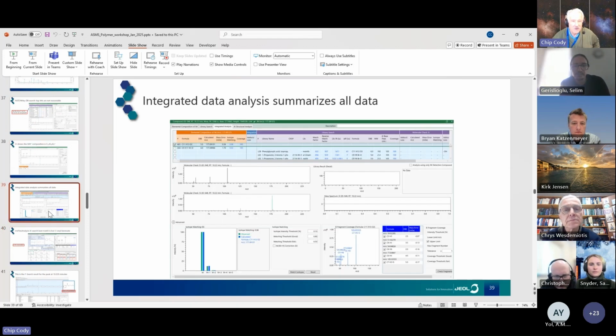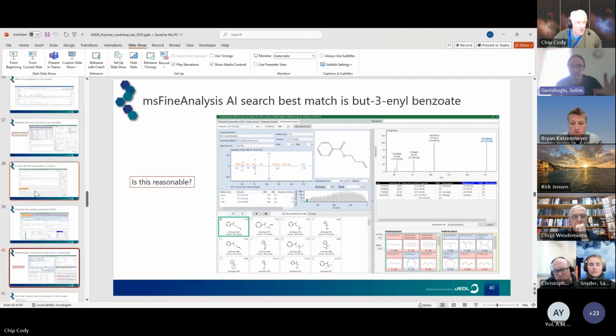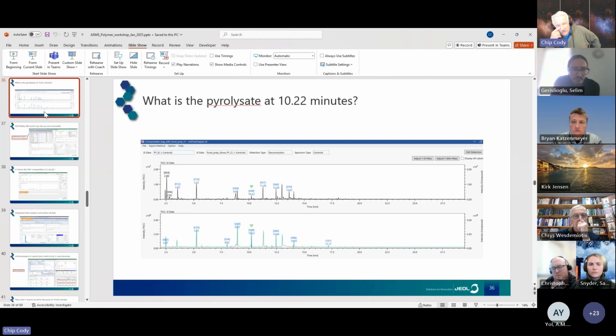So basically, I was curious about the hits it was showing, I think with the terephthalate and butanediol and adipic acid comprised copolyester. When you were seeing those hits, it's based on the EI fragments, right? And you said that it's a custom database that you use, or is it already built into the software so that it can identify polymeric oligomers? Yeah, let me explain a little better.